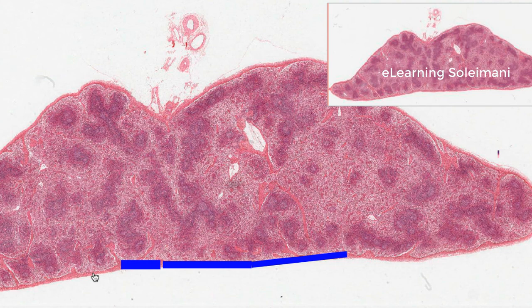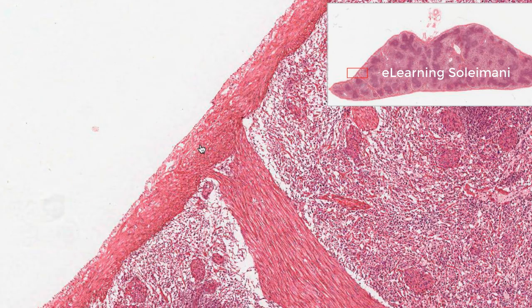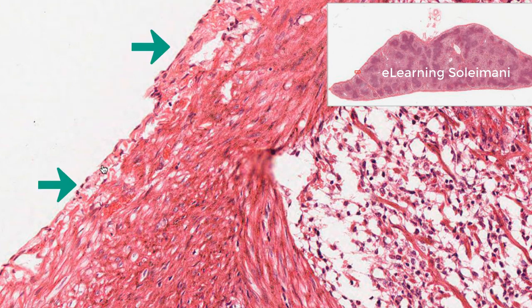When comparing the capsule of different lymphatic organs, it becomes clear that the spleen's capsule is different and made of squamous epithelial cells and connective tissue, which is called the serous capsule. You can see the nuclei of squamous cells, which are mesothelial cells of the serous capsule.